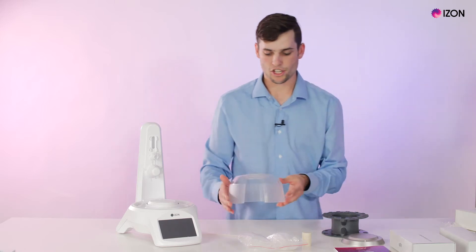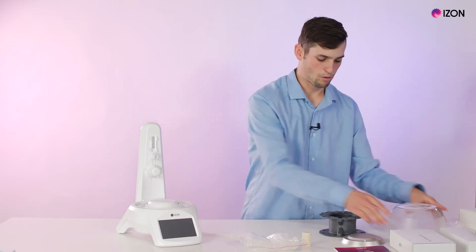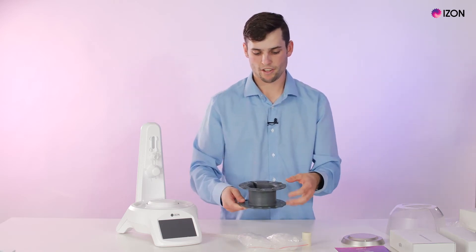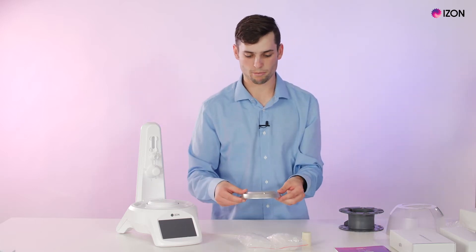We have a shield that protects the AFC when samples are running. We have the carousel with the two mil centrifuge side and the five mil centrifuge side, and the carousel plate which goes on top of the AFC.